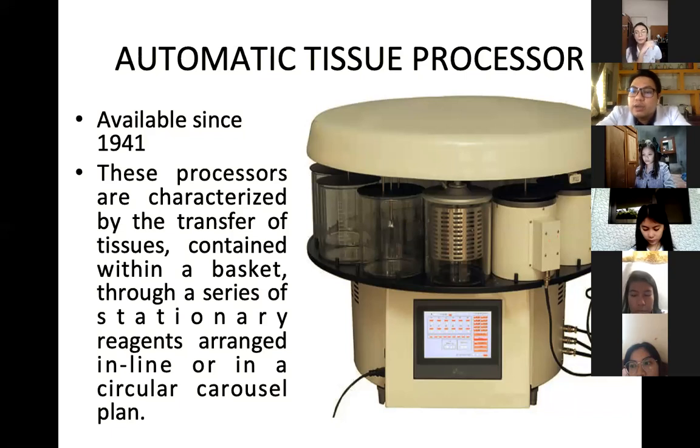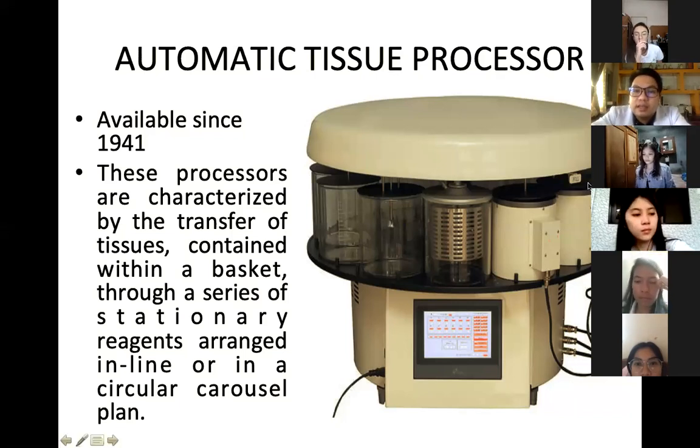So, ano yung napapadali sa trabaho ng medtech? Okay? Ito yung pag-transfer ng specimen from one container to another.